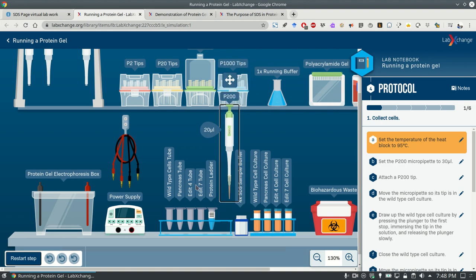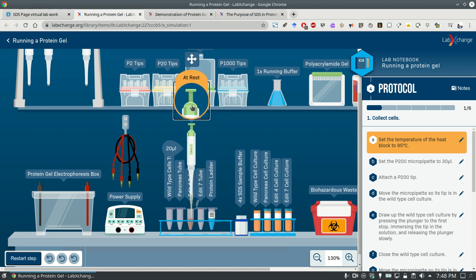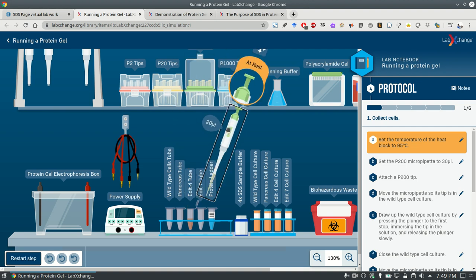And then if I want to put it in something, I got to open the tube. There it is. I opened it. You see that? And then I go to the second stop. Second stop. I just keep the mouse button down. Do not double click. You just press the mouse button and hold it there until the second stop shows up. All right? And you could see that there's liquid in here.